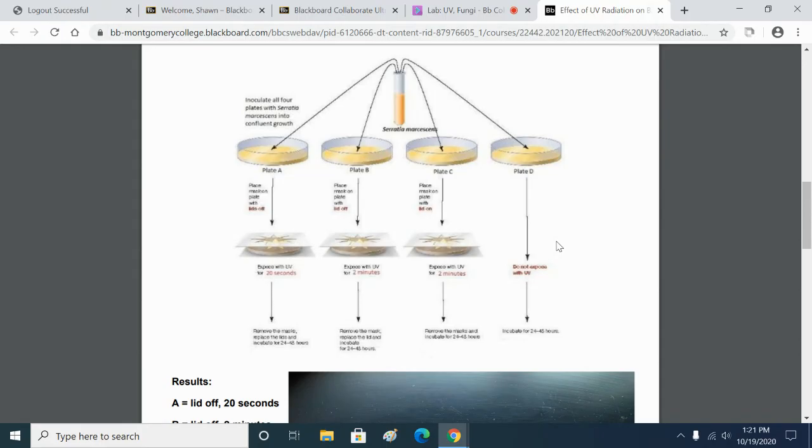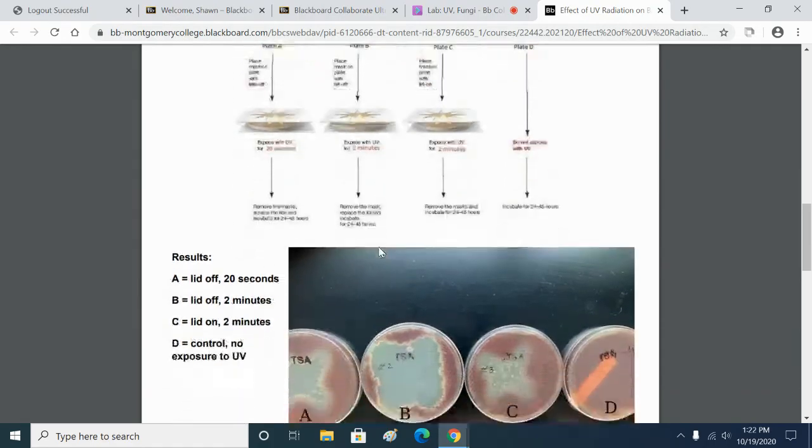Right, because the Serratia marcescens D1 will not produce red pigment at 37, but it will produce pigment below 30 degrees, like at room temperature. So we use it because the red pigment is easier. You get to see where the bacteria are. Plus, we're also going to see something interesting that can happen to those bacteria after they're exposed to UV light. So here we see the star-shaped paper cutout, but in the results, we used an X cutout.